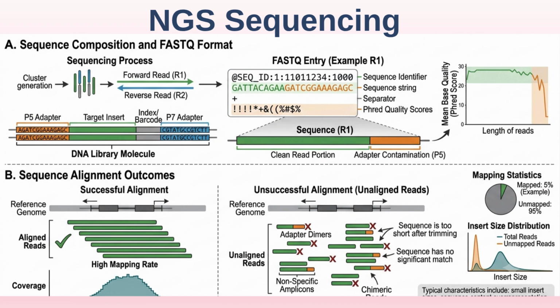For Illumina short-read sequencing, the workflow begins with genomic DNA being fragmented into smaller pieces. These DNA fragments are then ligated with sequencing adapters, which allow them to be amplified and sequenced on the Illumina platform. Once sequencing is completed, the raw reads generated are subjected to quality control processing, which includes trimming low-quality bases, removing adapter sequences, and polishing the reads to improve overall data accuracy.